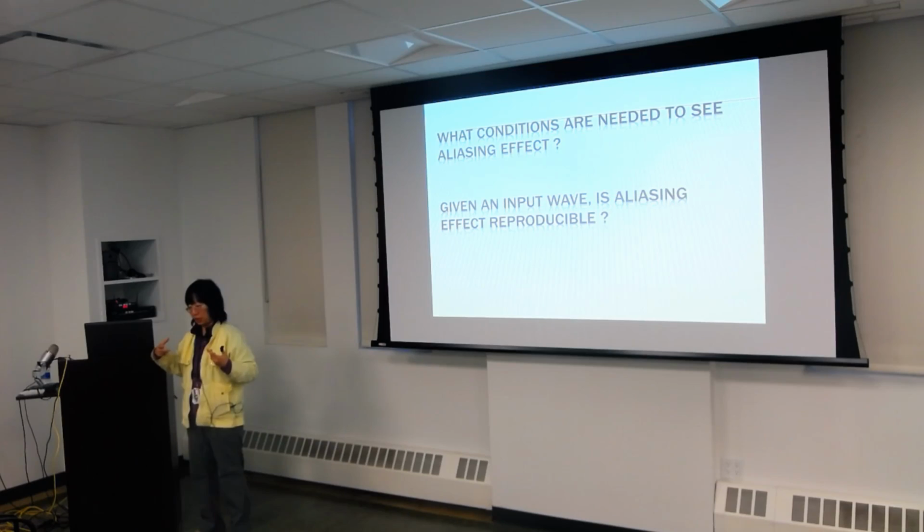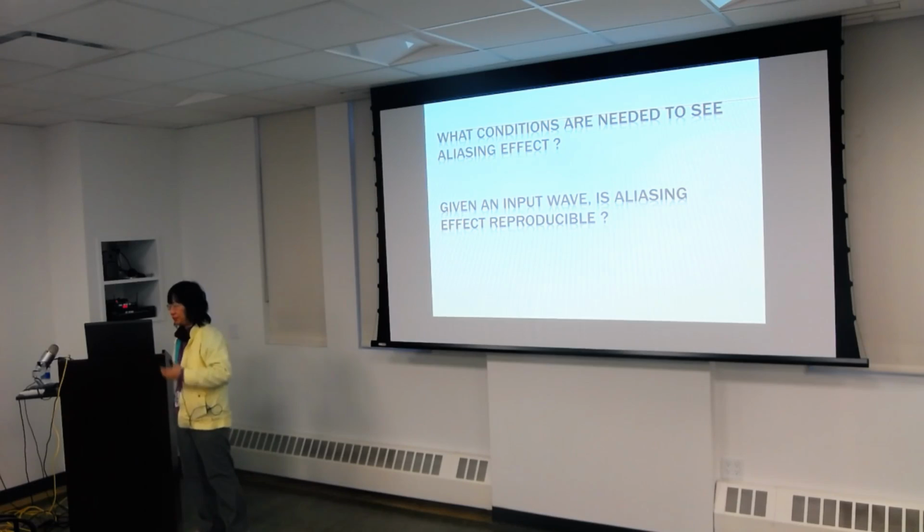And that's because the Nyquist limit doesn't have noise, is that right? The Nyquist limit just means how far you can describe your information up to in frequency space. That's what the Nyquist limit is. How far you can go up. But that's determined by the detector, and the detector has noise. I think that's where I'm confused.